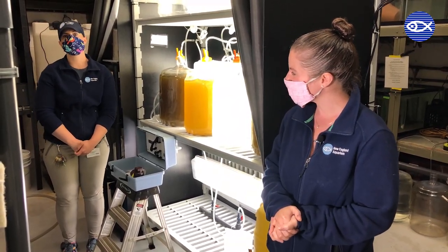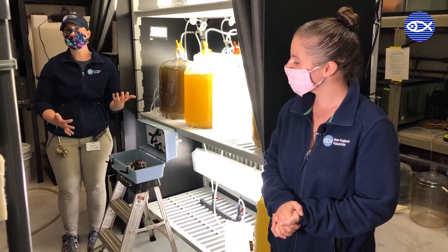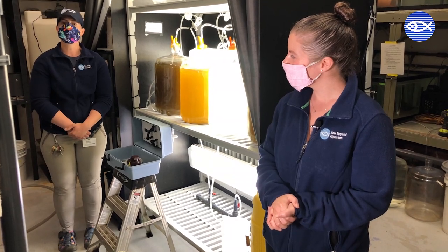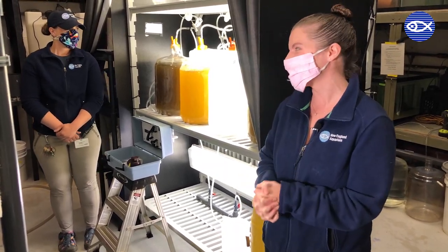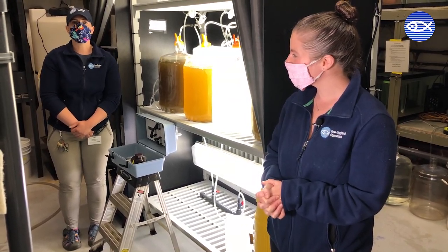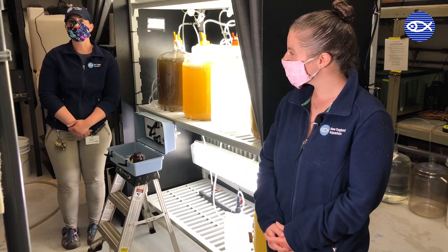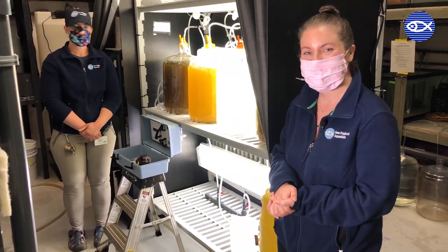Yes, so this is the live foods room. This is the room where we culture or grow different food sources for the animals in the aquarium. In here we have algae, which is what I'm going to show you today. We have brine shrimp, copepods, and we also keep mysis and grass shrimp in here as well. So today I'm going to show you how we grow algae, which is one of the food sources for different types of animals like filter feeders such as clams and mussels, and also for really small planktonic crustaceans like copepods.